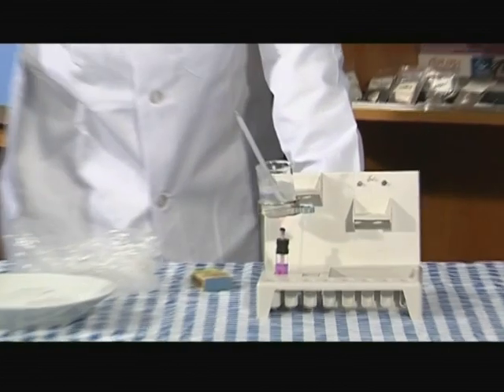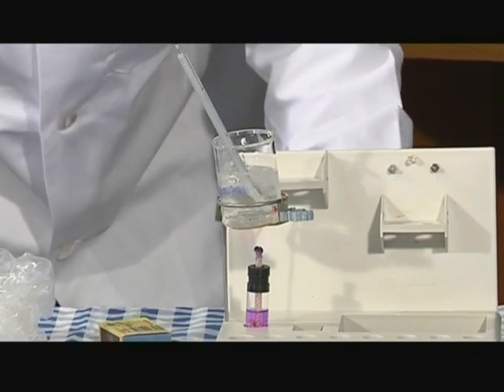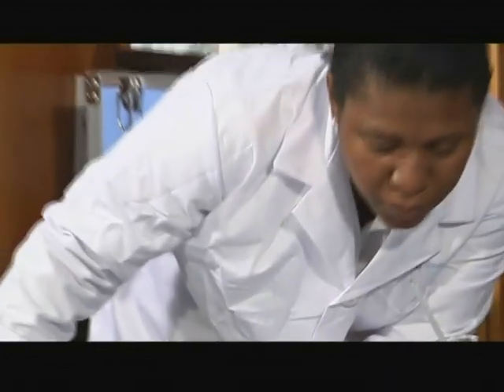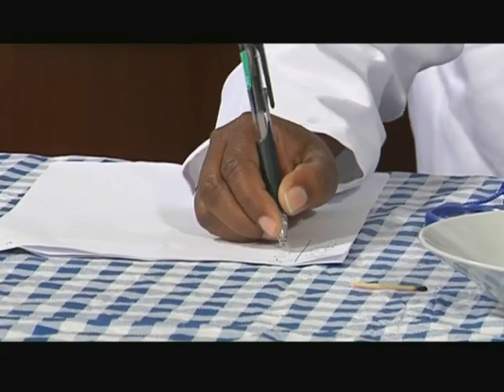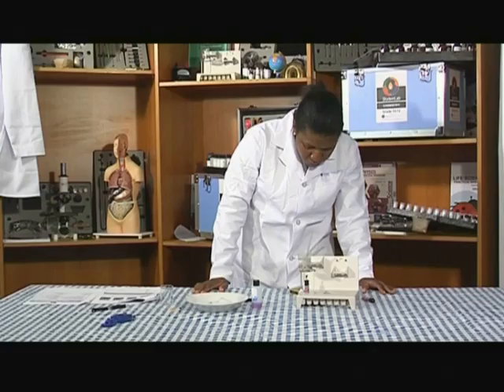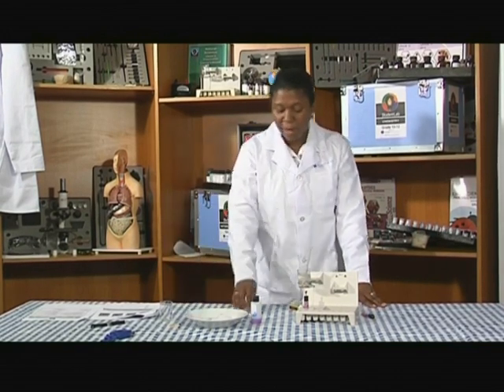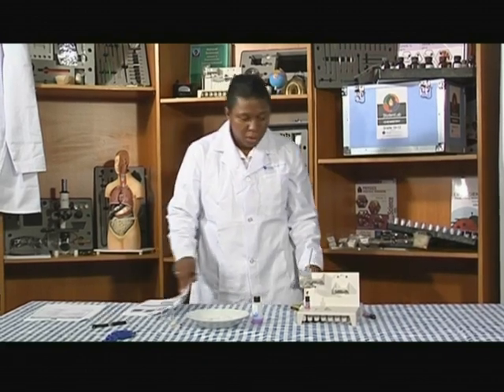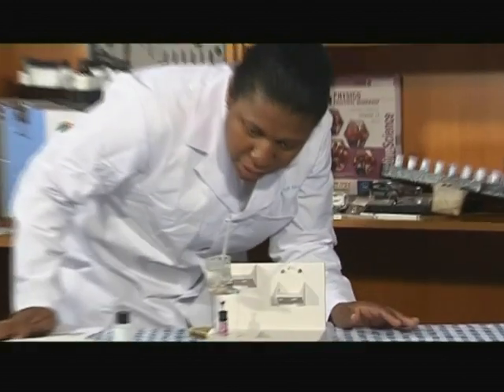One of the precautions when you're doing this experiment, make sure that when you take your reading, you don't take out the thermometer, because it's going to take the temperature of the room. When you take the reading when the water is boiling, make sure you take the reading until the temperature doesn't rise anymore. So you must just let the water boil until the temperature is constant. At least have about 3 readings of a constant temperature. Like at the moment, it's about 98.